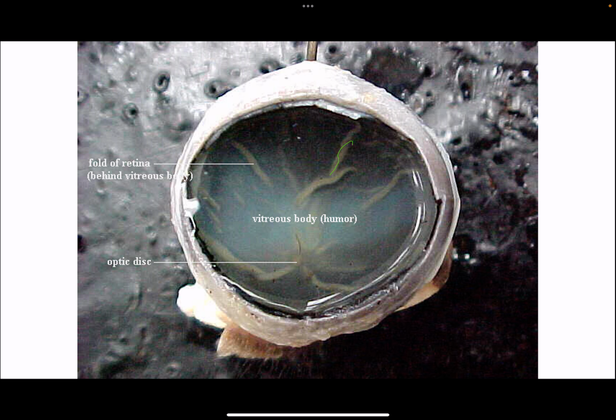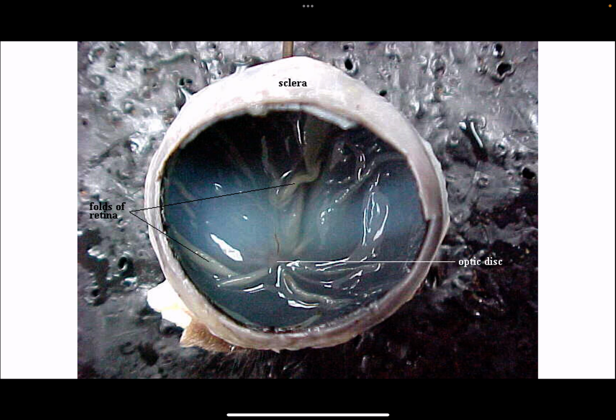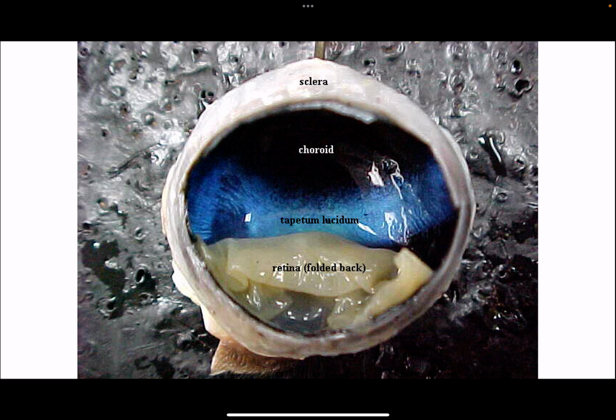This is the retina, a cover around this posterior segment. For the retina, when you take out that vitreous humor, this all comes into that chamber. So you can clearly see that metallic colored tapetum lucidum in cows and sheep, those kinds of animals that need night vision. This is the retina folding.